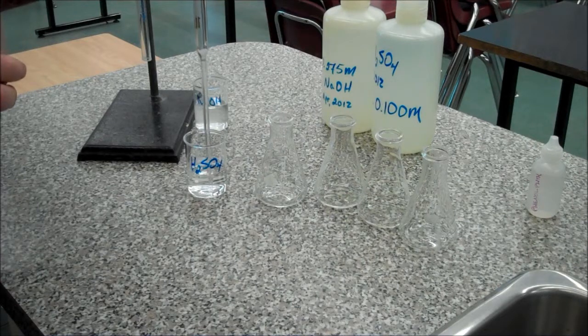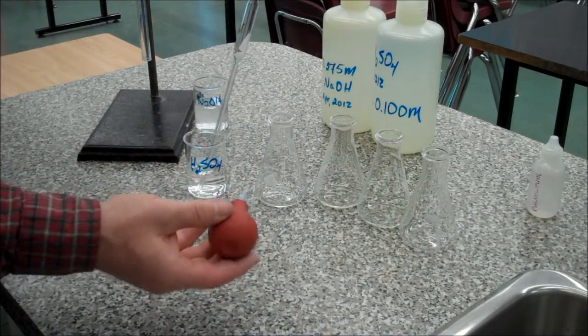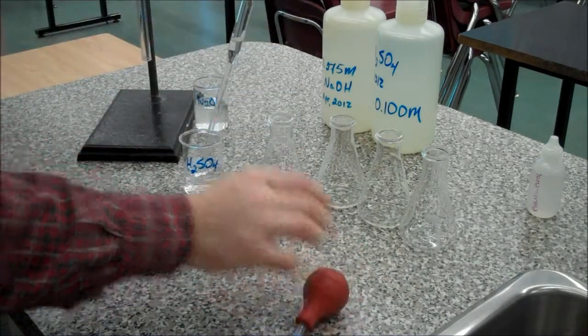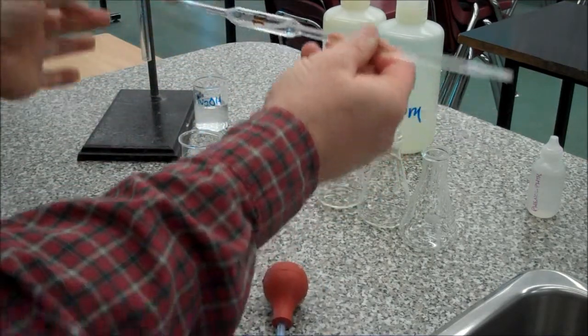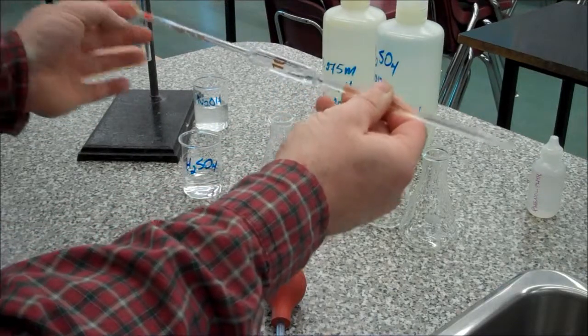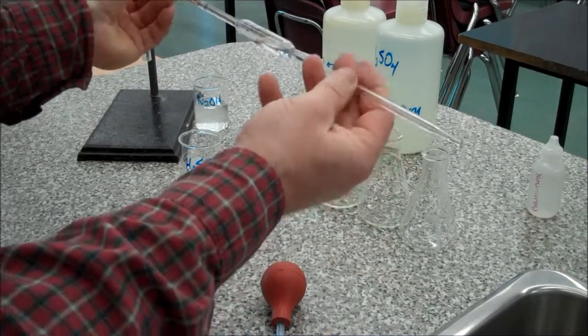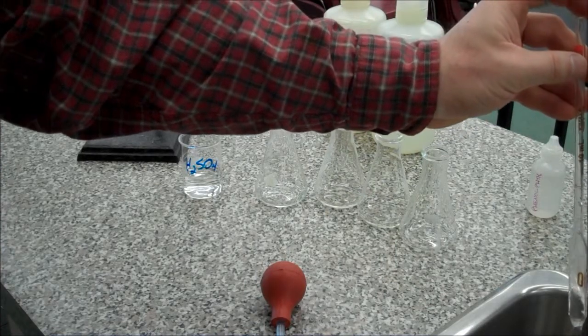If you touch it to the bottom, make sure you tip it over a little bit, like that, so that it doesn't vapor lock on the bottom. And you use a pipette bulb like that, squeeze bulb, being careful not to draw the fluid into the bulb. So, we draw up approximately half of the pipette. So maybe you can see it, touch the tip to the point, and so you can see it in there. And we let it draw towards our finger a little tiny bit, not much. And we roll it around like that, and we drain that into the waste. So this can go down the sink.